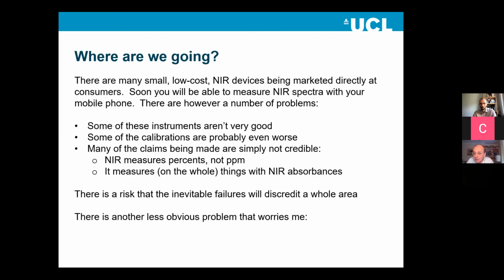How's NIR different from VIS? What kind of traits would NIR focus on? It's different from VIS in that it's wavelengths that are a bit closer to the infrared. It's wavelengths that correspond to vibrational spectroscopy absorbances in the infrared. And so it can enable you to measure things that visible light won't enable you to measure.